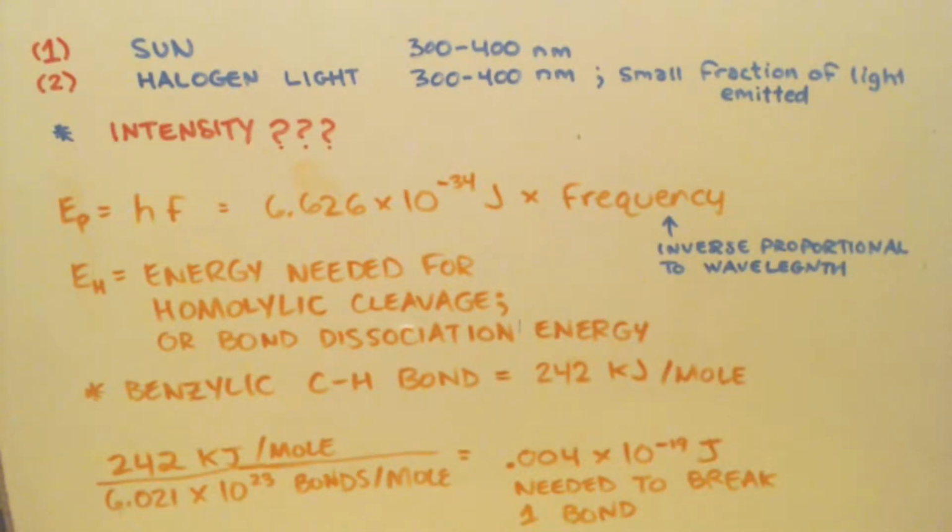But by intensity, I mean if you have 1 photon per second, because it's a type of UV light that's attached to your key ring, and it's tiny as heck, it runs on a little tiny battery or whatever, that may not be good enough to do the reaction fast enough. You might be there for days and days and days just trying because you don't have enough intensity. You don't have it bright enough.